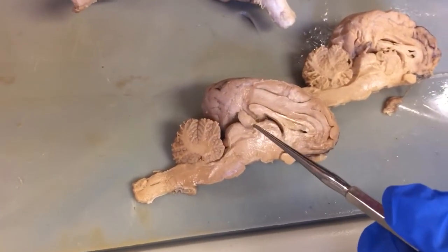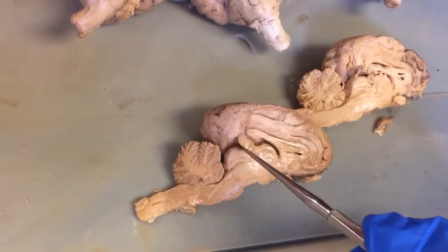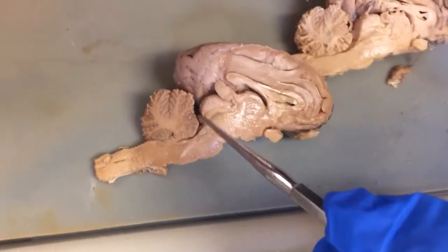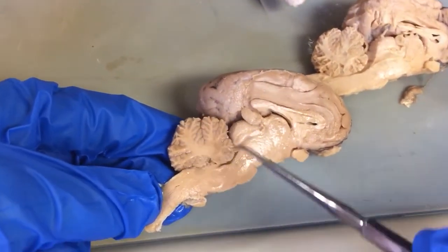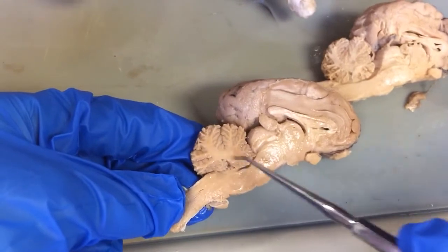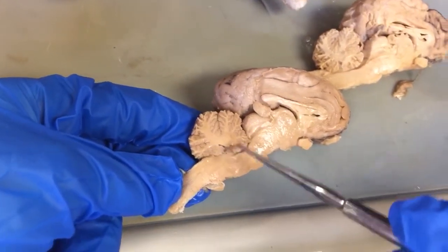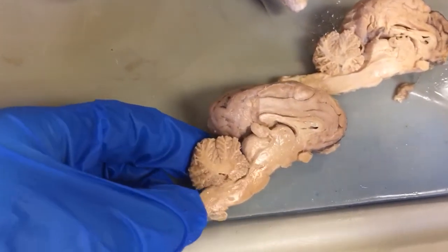So you've got your pineal gland here, and then this is your anterior colliculus, this big hump here, and then there's a little hump behind it called the posterior colliculus, okay? And then you have your cerebellum here, and you can see this really cool tree-like branching structure within the cerebellum. That's called the arbor vitae, which translates into tree of life. So it's a cool structure.